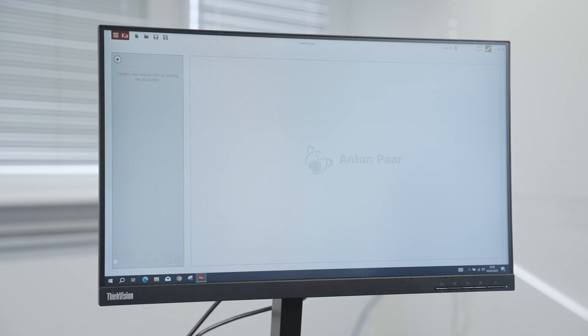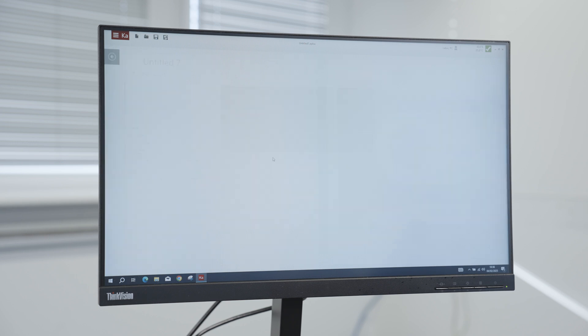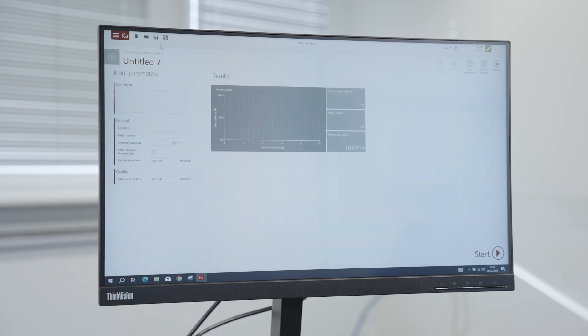A simpler measurement mode is the transmittance measurement. Only the measurement duration and the temperature can be adjusted.